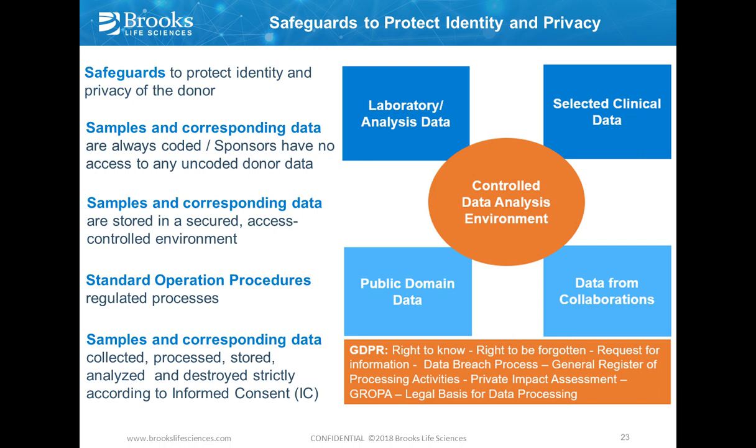Okay, and in the end, of course, we should also destroy or use the samples according to the informed consent, meaning we need to have the timestamp on it and we need to know when they have to be destroyed. I just made a little box down there to the right addressing the GDPR, summarizing a few of the key elements, like the data donor has the right to be forgotten.